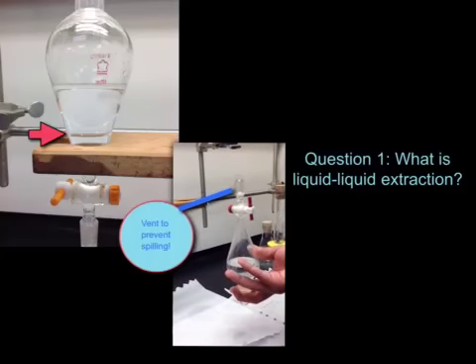This will allow the benzoic acid to fully reach equilibrium between methylene chloride and the aqueous layer, and then you'll just let it sit there so it can distinctly separate between the two layers.